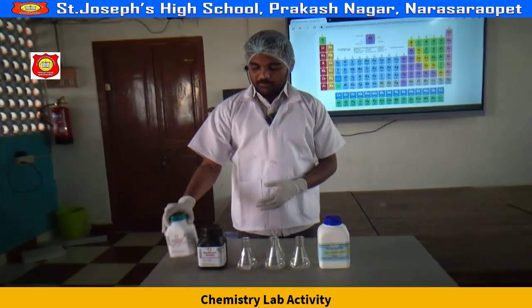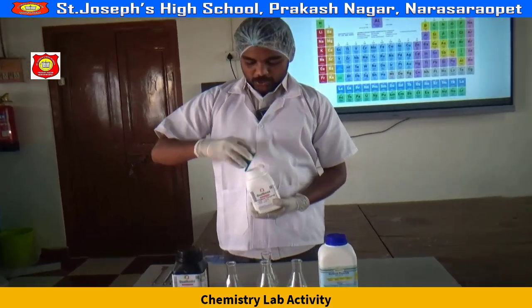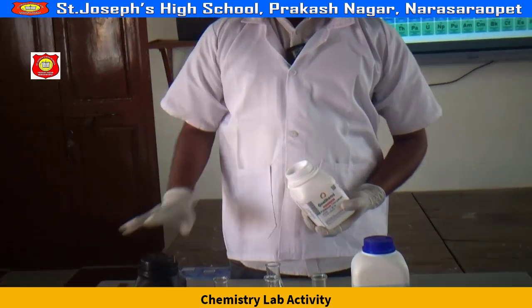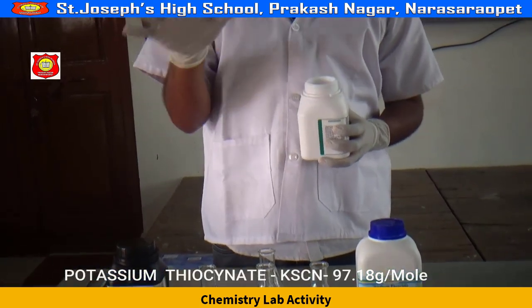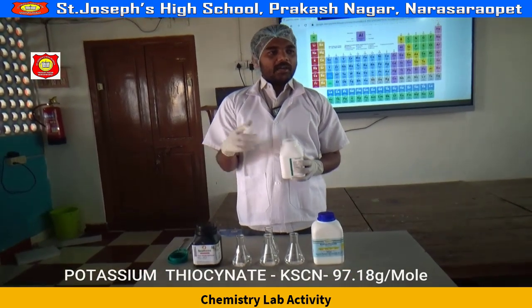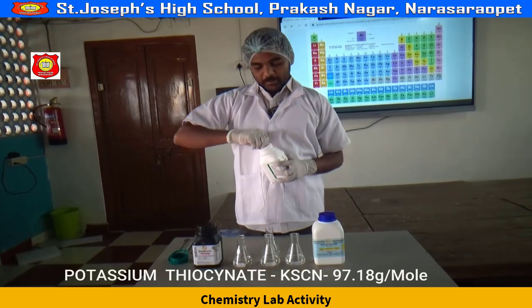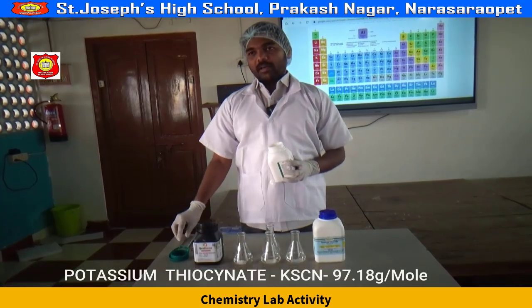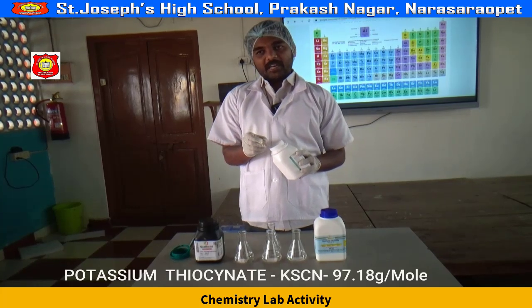Now we are going to add potassium thiocyanate, and we have to maintain one more important thing: individual spatulas for each and every chemical, because when we combine chemicals with the same spatula again and again, there may be a chance for a new reaction to occur. To overcome that, we have to use a separate spatula for each chemical.